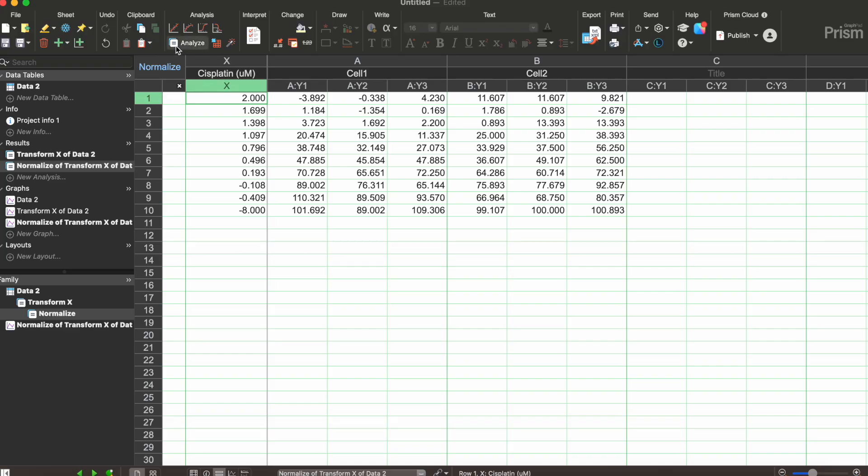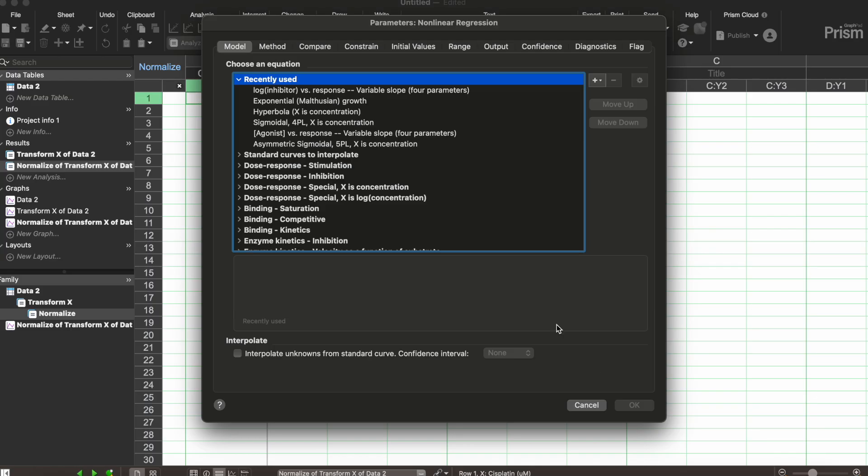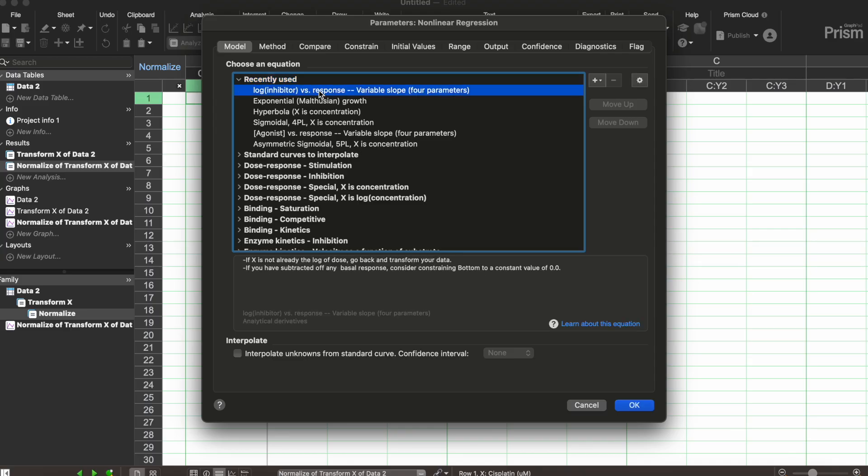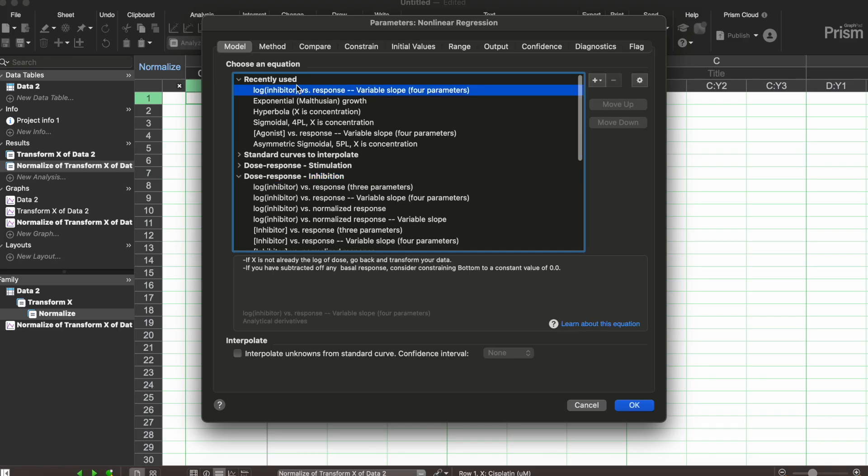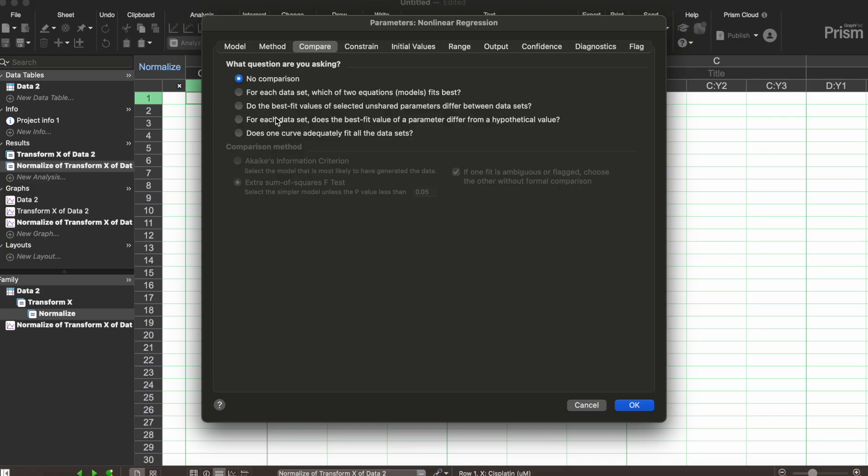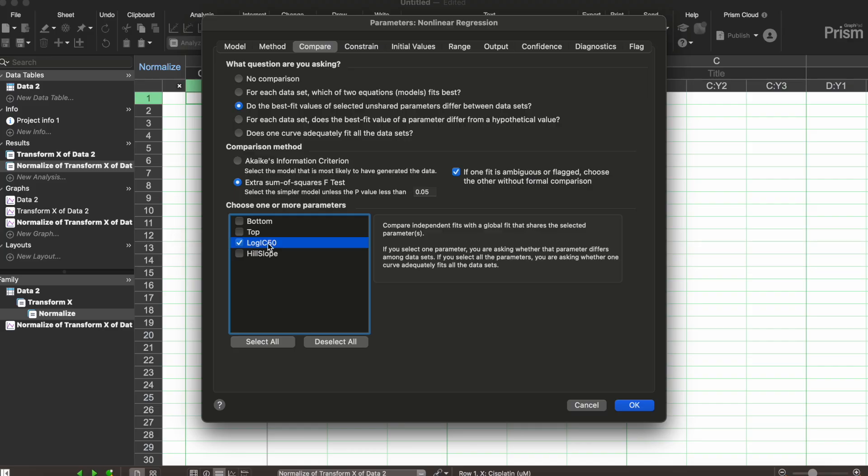Now I'm gonna push analyze again. This is the third analysis that we're doing and we are going to do a nonlinear regression fit. I'm gonna push ok and this is where it gets a little bit more complicated. So we're going to do a dose response inhibition and we're gonna select log inhibitor versus response variable slope with four parameters. Then we are going to go up to compare and we want to do the best fit values with the log IC50 as being one of our parameters.